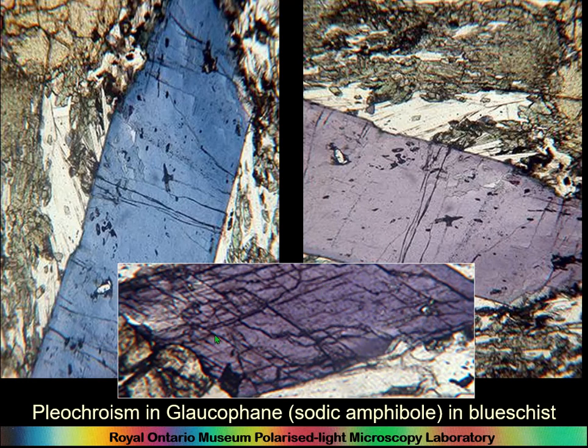And so if you ever see a mineral with 2 cleavages at 120 degrees like this, it could be colorless, it could be green, it could be brown, it could be blue, but it's in the amphibole group. That's why quite often I will suggest you identify it as an amphibole rather than hypothesize exactly which amphibole it is. Hornblende, which is probably the most common amphibole, is one of a couple of green pleochroic minerals. So best to just call them amphiboles and explain what is distinguishing about them, and possibly suggest this might be, say, hornblende, because it's green pleochroic.